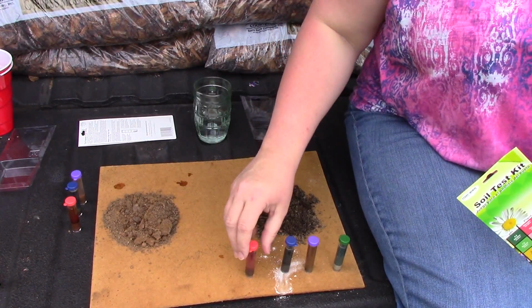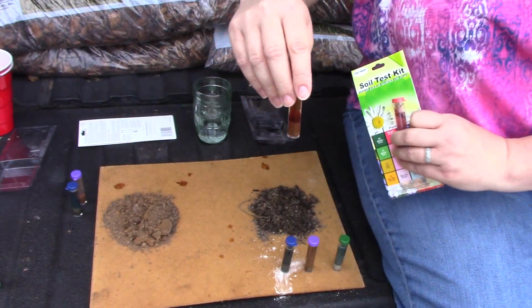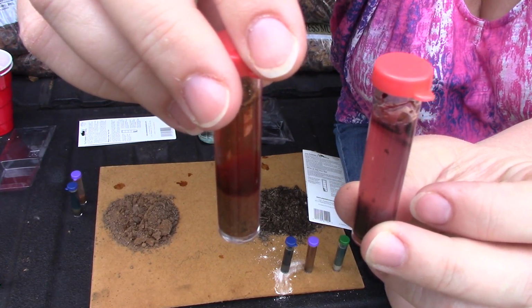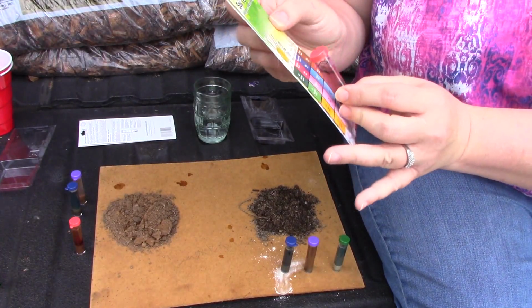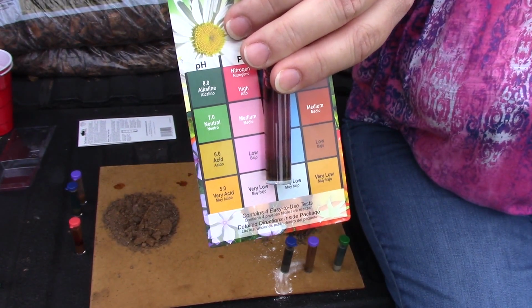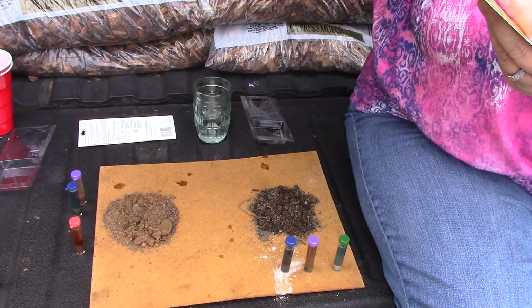The next one is nitrogen, which is the red one. And this is the difference between amended and non-amended. Here, let me put this down. That's the difference in how it looks. This is amended and non-amended. The amended is probably medium high. If it is high, you don't really need to do anything at all. It's fine. Do you think that's medium high or high? It's more on the high.